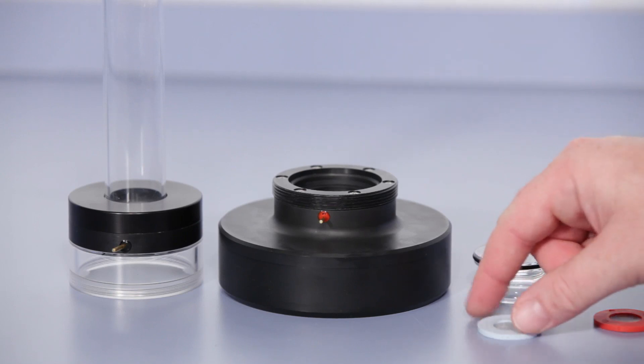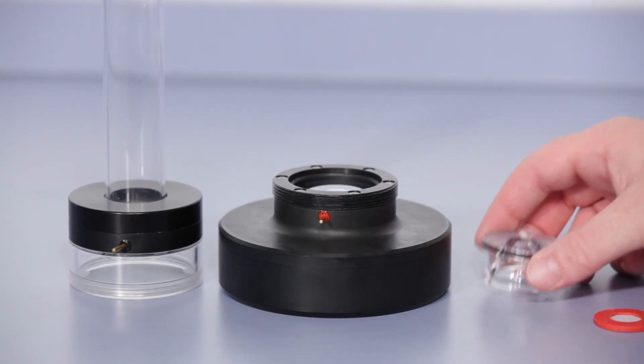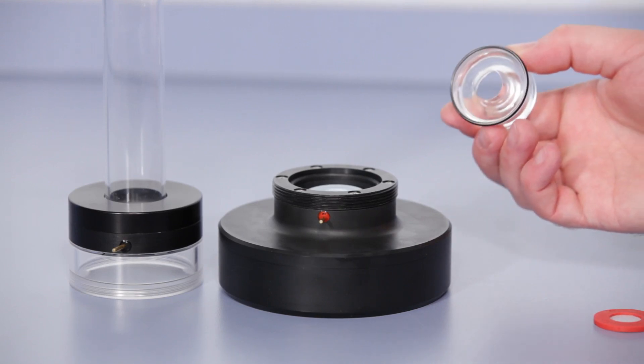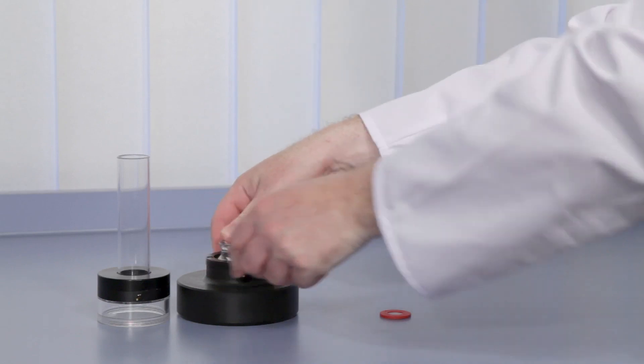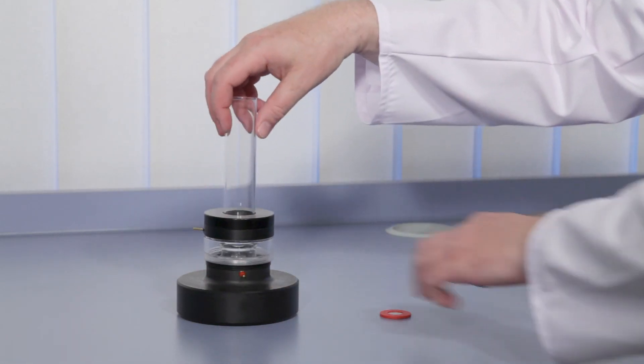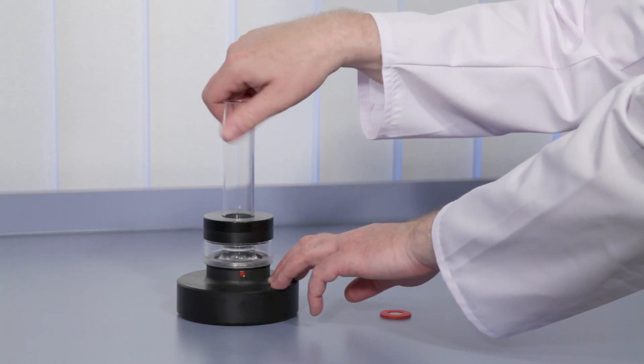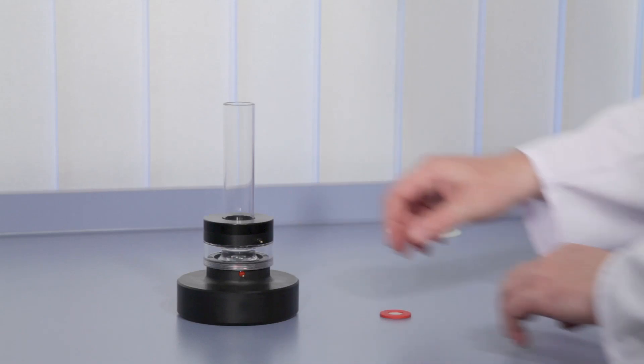To reassemble the measuring cell, position the screen, push in the adapter piece with its smaller opening facing towards the screen, and screw on the suction tube until the two electrode pins are in parallel. Avoid over-tightening the suction tube to prevent damage.